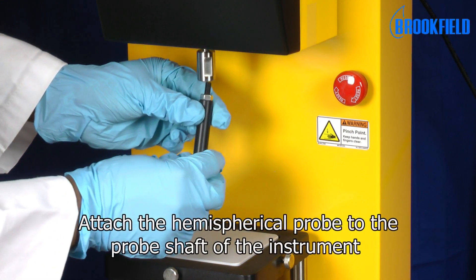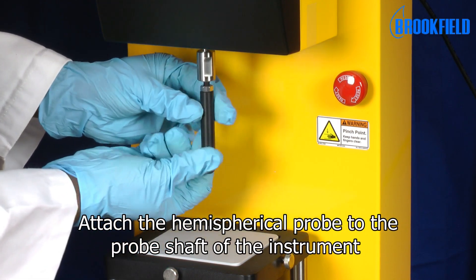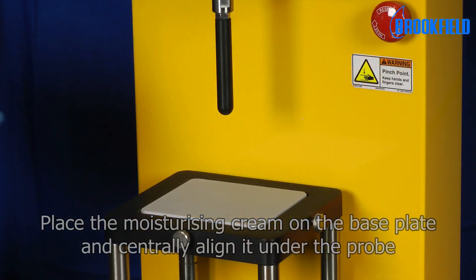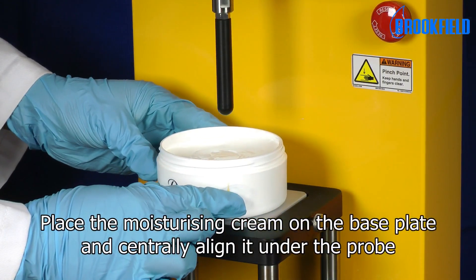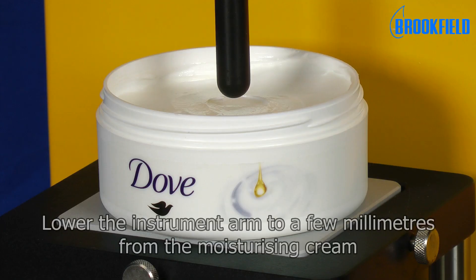To set up the test, attach the hemispherical probe to the probe shaft of the instrument. Place the Moisturizing Cream on the base plate and centrally align it under the probe. Lower the instrument arm to a few millimeters from the Moisturizing Cream.